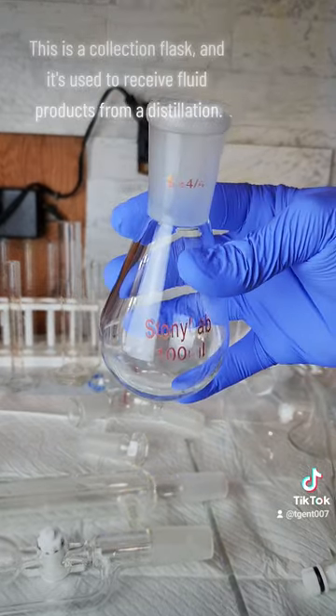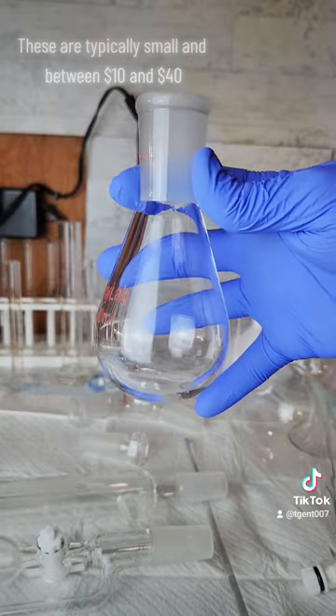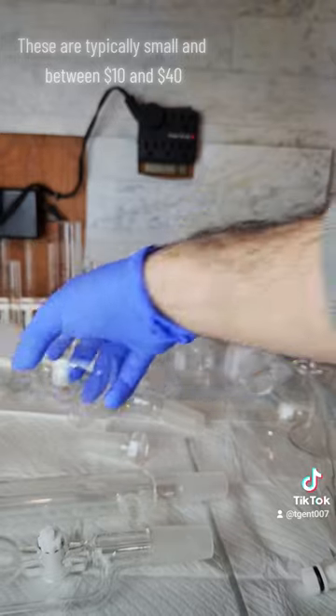This is a collection flask and it's used to receive fluid products from a distillation. These are typically small and between $10 and $40.